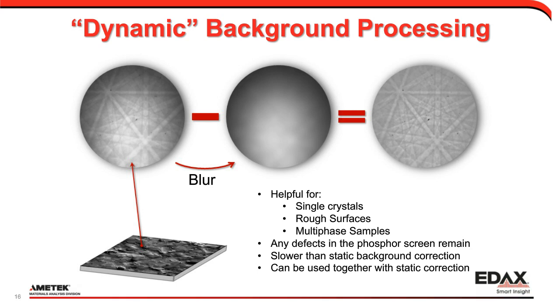Now, if you ever happen to want to scratch your phosphor screen for some reason, I would tell you to make sure it's not a line. The Hough does a good job of finding lines. So if you have a phosphor screen and you damage it, try not to do it in a line. But I've never actually seen CL be an issue in any major way. So I don't think I would have an issue with CL.